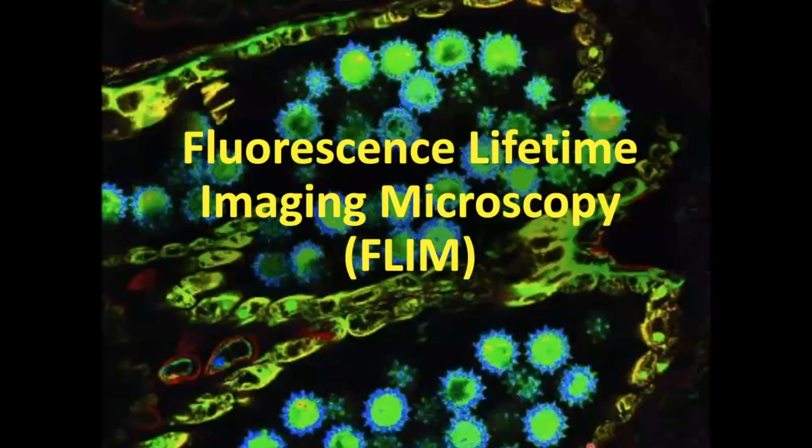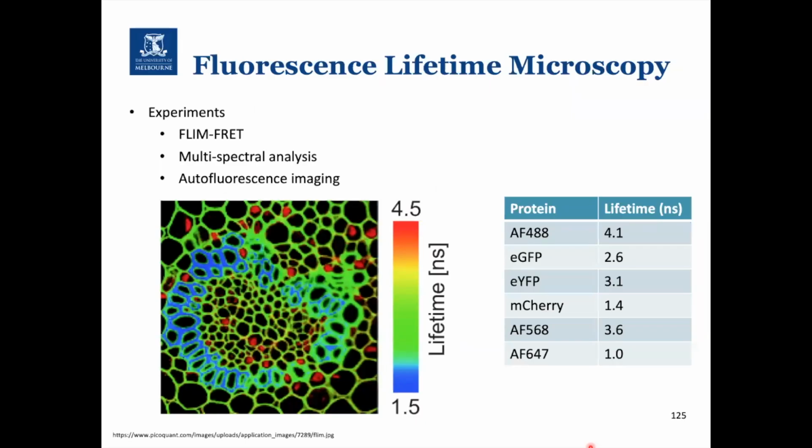So let's go through FLIM now. As I mentioned, independent of the spectrum or the wavelengths generated from the emission from your molecules, the fluorescence lifetime can be very different. For example, AF488 and enhanced GFP, which have very, very similar spectral characteristics, so you wouldn't be able to separate those on a standard confocal, have very different fluorescence lifetimes, which would allow you to actually separate them out.